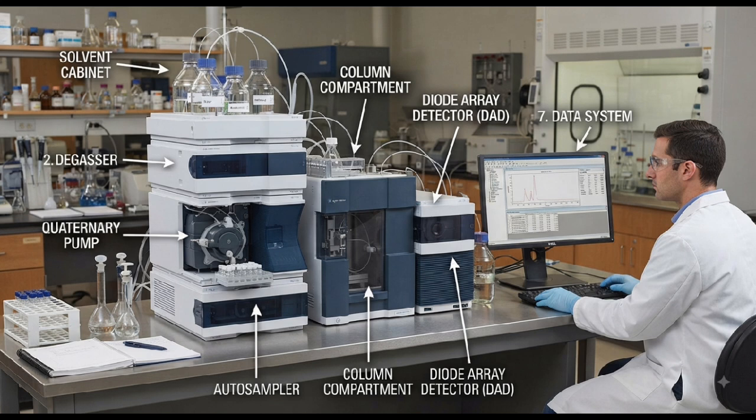Introduction of HPLC. High performance liquid chromatography, commonly known as HPLC, is one of the most widely used analytical techniques in pharmaceutical quality control. It is used for identification, assay, impurity determination, related substance, dissolution, degradation product analysis, and many other applications.